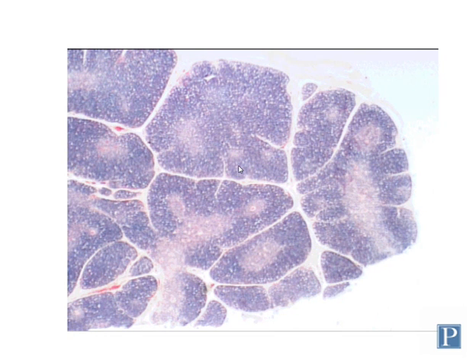Next, we have a section of the thymus, another dedicated lymphoid organ. As you may recall from lecture, the thymus is a site of T cell maturation. T cells are produced initially in the bone marrow, but they then migrate to the thymus, where they continue to mature and be programmed. And so the thymus only contains T lymphocytes. There are no B lymphocytes, so there are no lymphoid nodules.